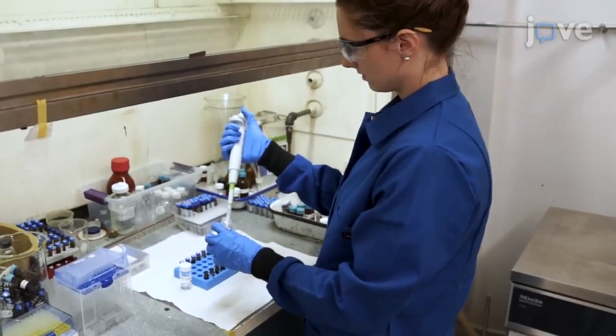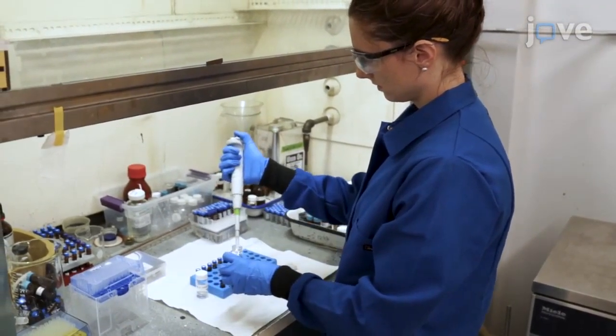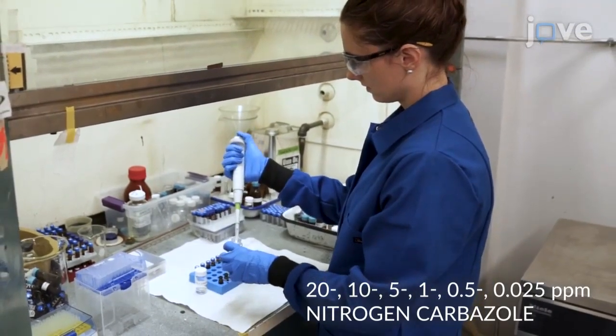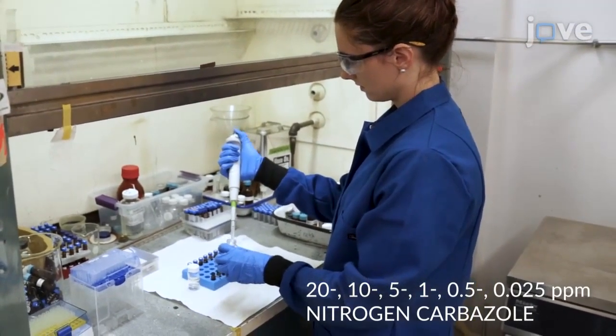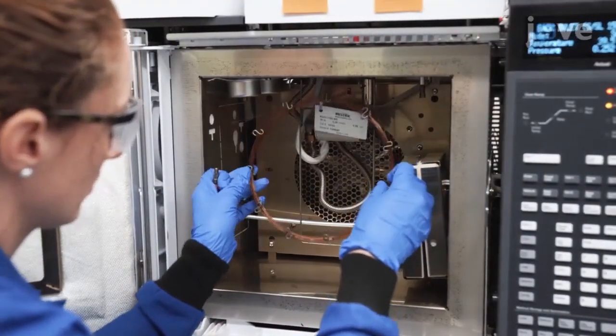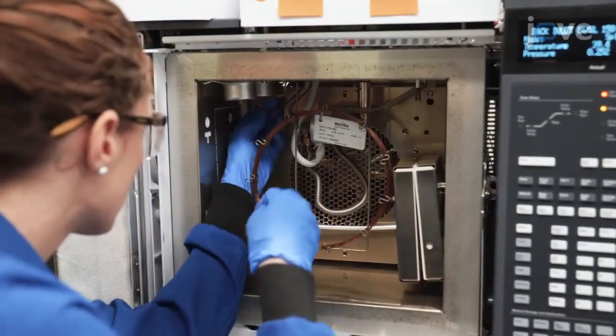Before beginning an experiment, perform the calibration standards as indicated and add 1 milliliter of each standard into individual gas chromatography vials. For column installation, first place a 30-meter primary column into the gas chromatography oven and connect the column to the splitless inlet.